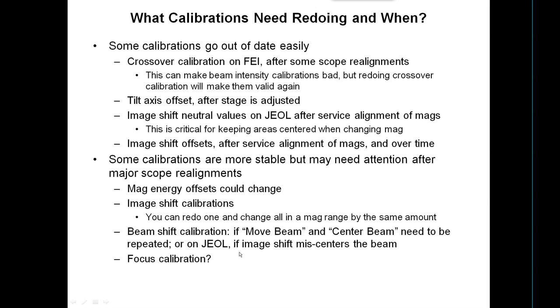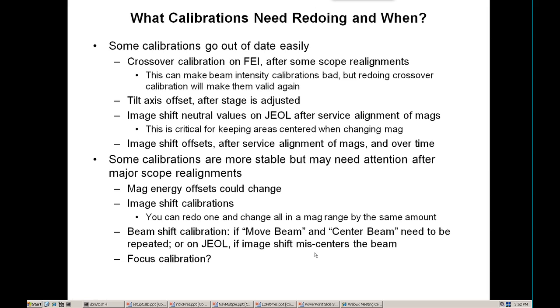The beam shift calibration could also go out. If you see that the move beam or center beam functions need to be repeated, or on JEOL if the beam gets off-centered during an image shift, that probably means the beam shift calibration is not good — on JEOL the program has to independently shift both the beam and the image using this calibration, so it is critical there. The focus calibration tends to be stable as long as alignments are the same, but people have raised reasons why it might go bad, and some individuals may need to do their own calibrations.